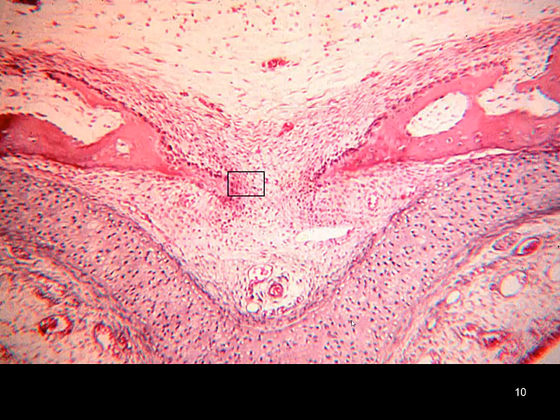I think you can probably recognize in this image that this is not really looking like bone. We have these large cells, lots of lacunar white spaces. This is going to be the hyaline cartilage of our nasal septum, I believe that's what this is, or the nasal bridge. And then we've got our bone here in this location. We've got some of our osteoblasts, a lot of progenitor cells that are going to be in this neighborhood as these two compartments are growing together.